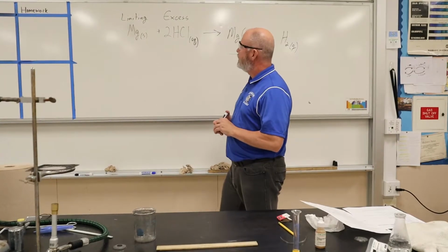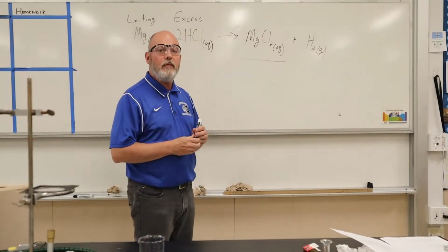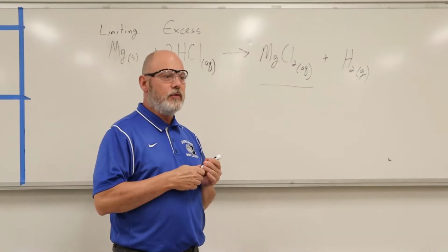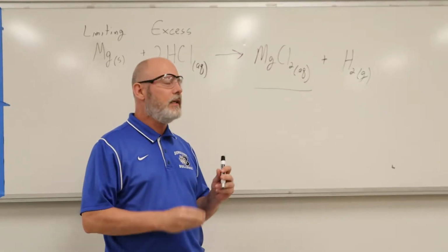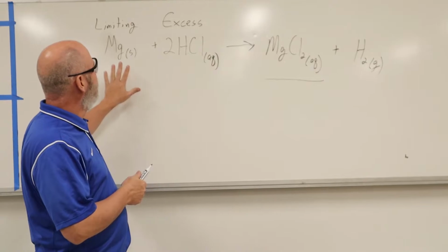Okay, and this is going to be one of the first of two stoichiometry labs that we're going to do. And again, normally you guys would do this in class with your partner, but that's not the case this year. So here we go. All right, so we're going to do this reaction here.